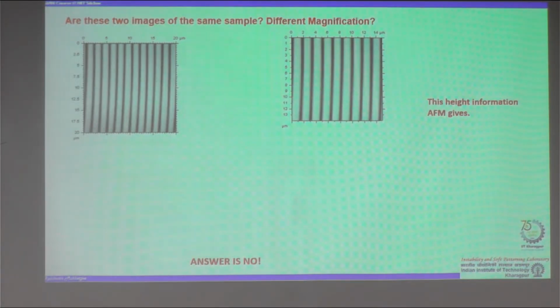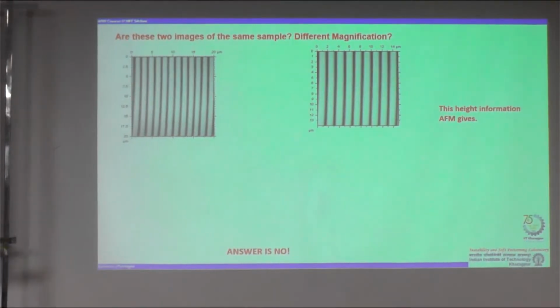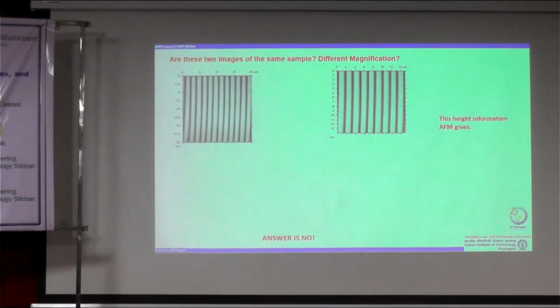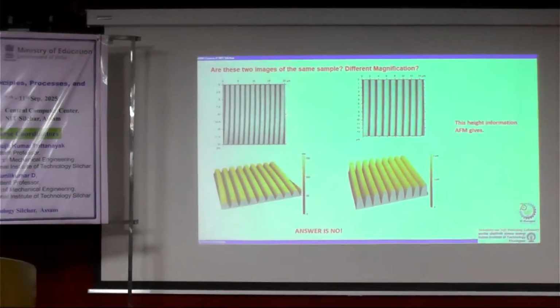And therefore, the atomic force microscope, which is in fact a very new instrument, right? It was discovered in 1986, right? And there's a very interesting story. It has led to huge advancement in the field of nanotechnology, devices, and everything, microfabrication or whatever.